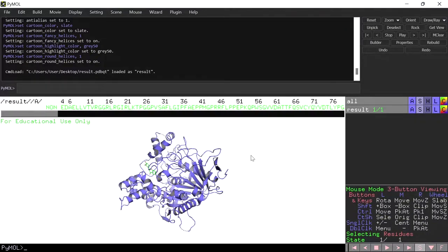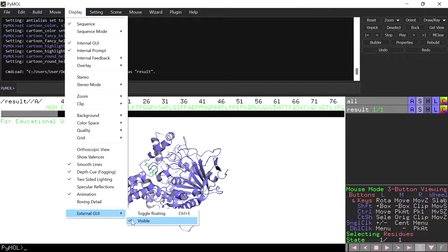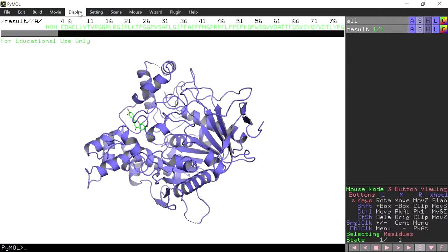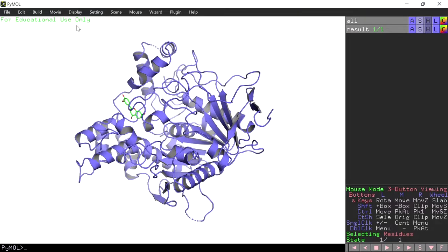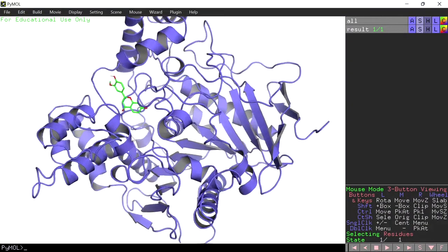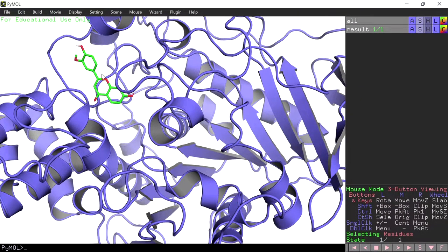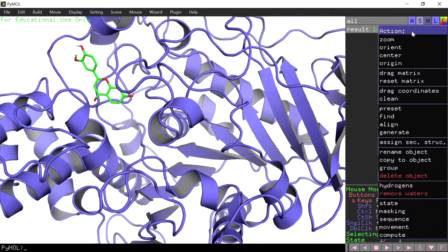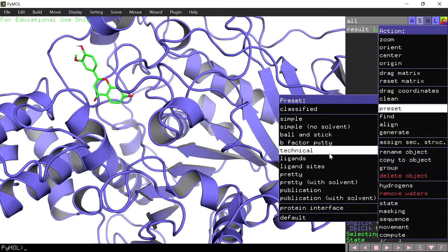Next, let's analyze the AutoDock result. I am going to remove the external GUI to get a better view and also remove the sequence. This file is a protein-ligand complex file which contains the protein along with the docked pose of the ligand. To analyze the interactions, go to the action button next to the corresponding object name, select preset, and then select ligands.